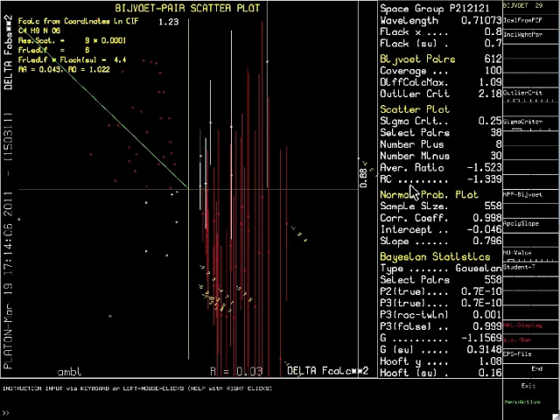If the cif file that was loaded contains a Flack parameter, it will be shown with its standard uncertainty at the top right of the screen. This structure obviously has not been determined accurately enough to make an assignment based on the Flack parameter. The standard uncertainty is too high.